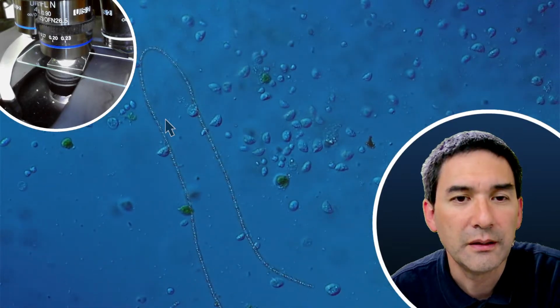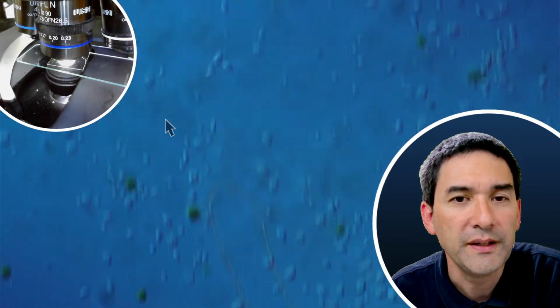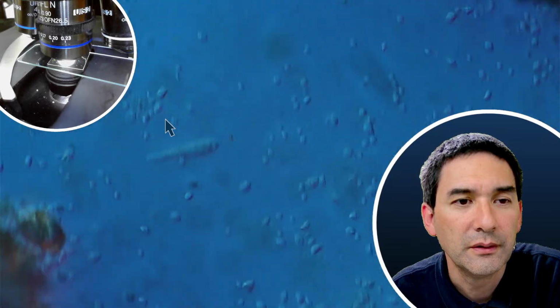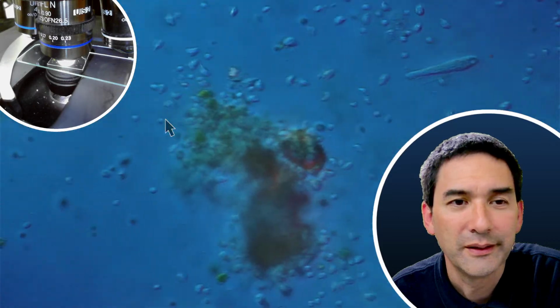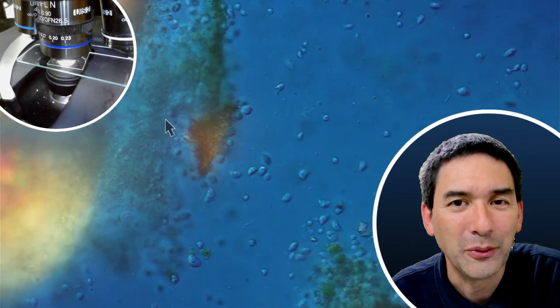So here again, plenty of things that we're able to see. It's quite remarkable, I think. Quite a bit going on here.